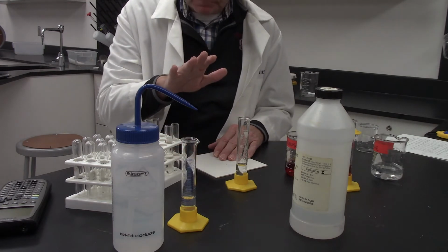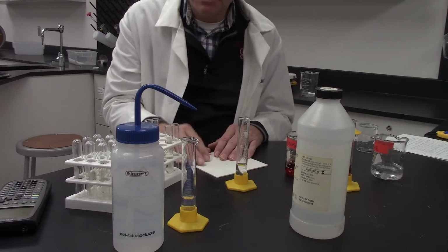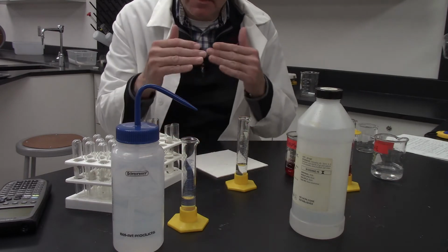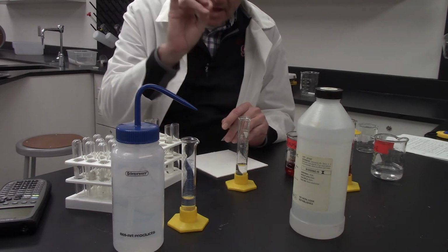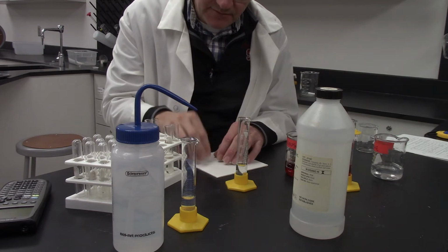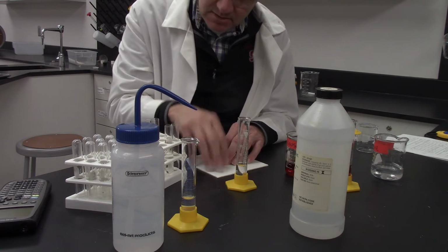The hydronium ions are part of a secondary reaction that's going to take place. This is where we said, hey, you can make these intermediates. They get used up and consumed. So even though the hydronium ion, when you look at the overall reaction, actually shows up as a product, we're going to see if the concentration of the hydronium ions actually affects the rate of the reaction.